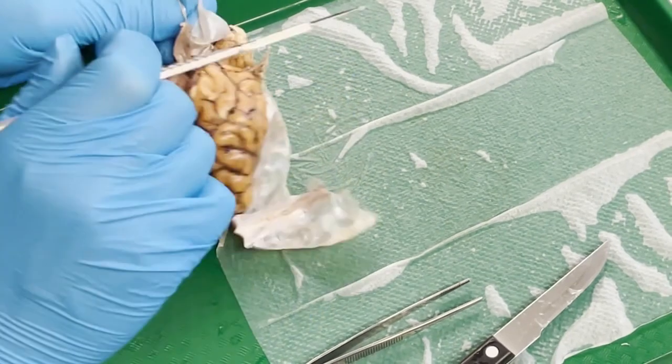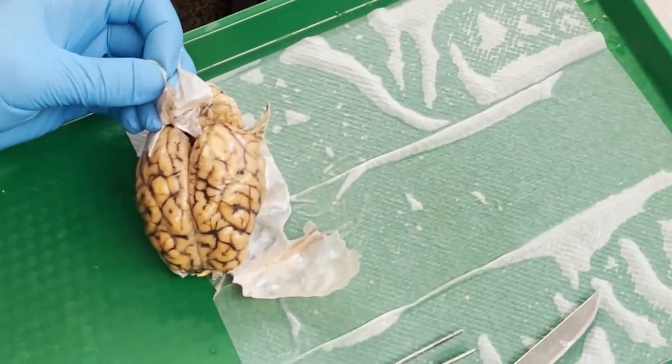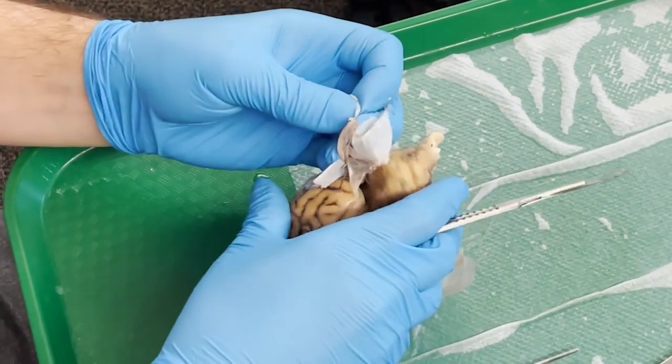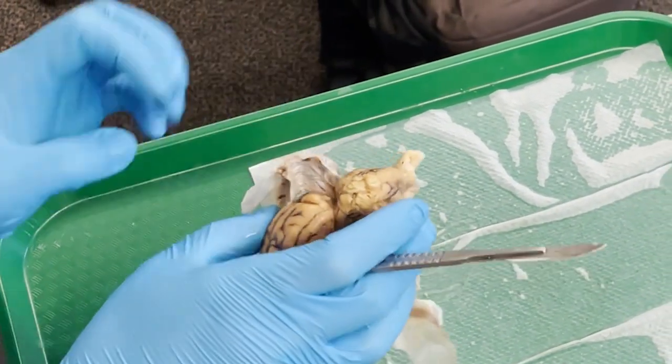It's true. Okay. Just gonna carefully cut that. You can just rest the scalpel blade and bring whatever you're trying to cut through up to it rather than forcing it down. So I recommend doing that. And now I can just peel around and out to remove this.